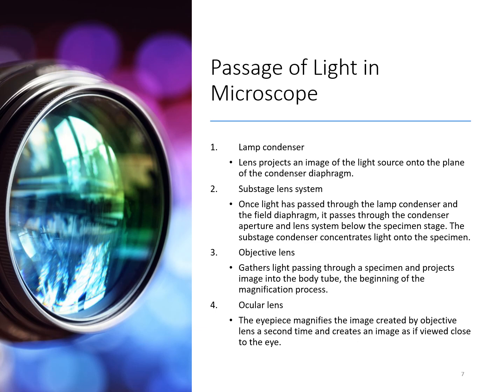And of course the microscope does use a light source. That light source is generally at the bottom base part of the microscope somewhere, and then that light source will go through a condenser. And then up through that condenser, it'll go through the substage lens system, which is going to be your lenses and things that are below where your actual stage is and where you place your slide. And then that light is going to pass through those condensers, and we're going to learn how to adjust some of those condensers to make sure that you get your optimal light path coming through that specimen.